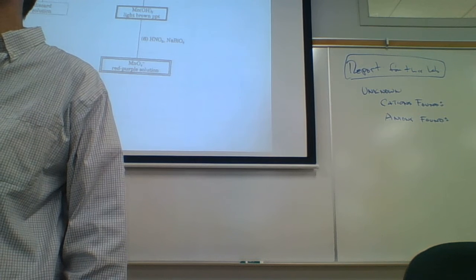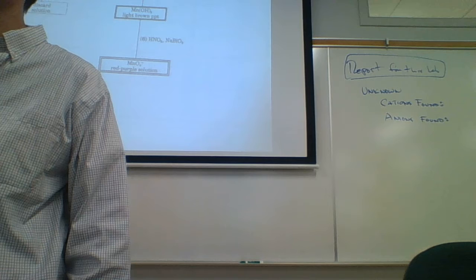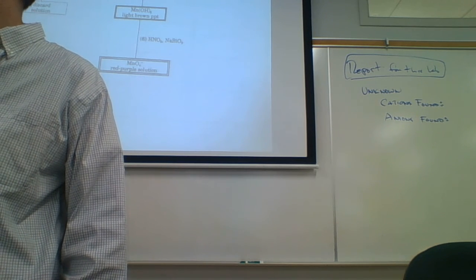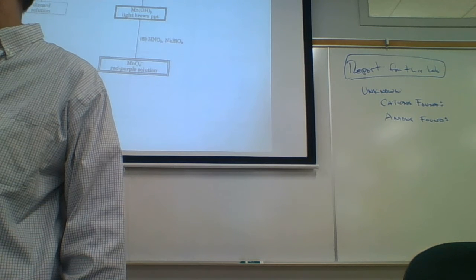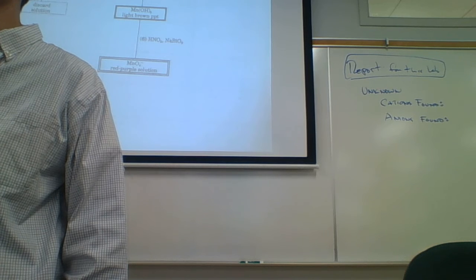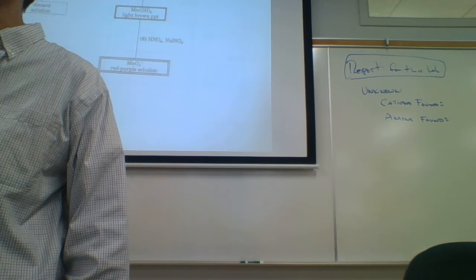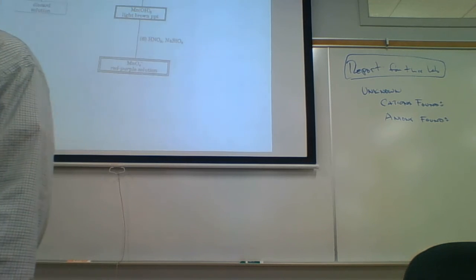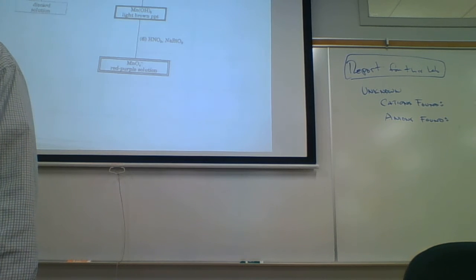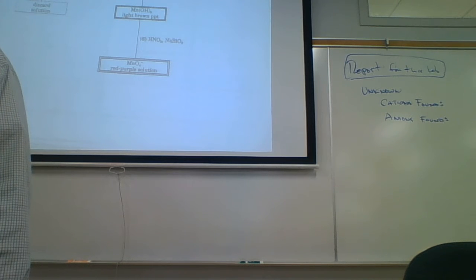What else do you want to watch out for in this lab? Silver nitrate. Watch out for that stuff, because what does silver nitrate do? Turns your skin black, basically. And in high enough concentrations, it'll cause blisters. Yeah. And lead. We want to watch out for lead, heavy metal, poisoning, toxic.